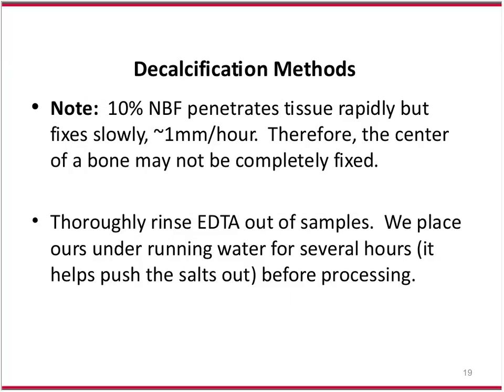And we see that a lot on stuff that has come into us, as I said, that, oh, we fixed this and we've already decalcified it. If it's not, we have to go by what they say, but when we're cutting and staining at the end, we can tell that it wasn't a 3-day fix or the standard time of decalcification in which we do.